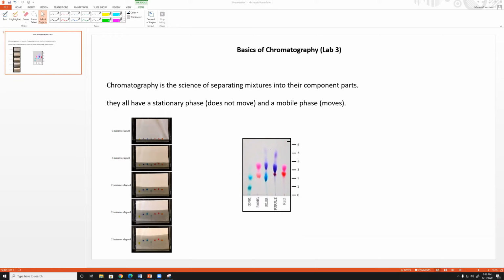Let's look at the first one, which is blue. For blue, you have two dots. One dot is right here, and it aligns with this B1. So you can say the blue dye is going to have B1, and it also has a dot up here. This happens to be a purple dot, but don't worry about the color so much. The most important thing is where they're located, their distance away from the starting point. That's usually measured, and you can determine the Rf from that.